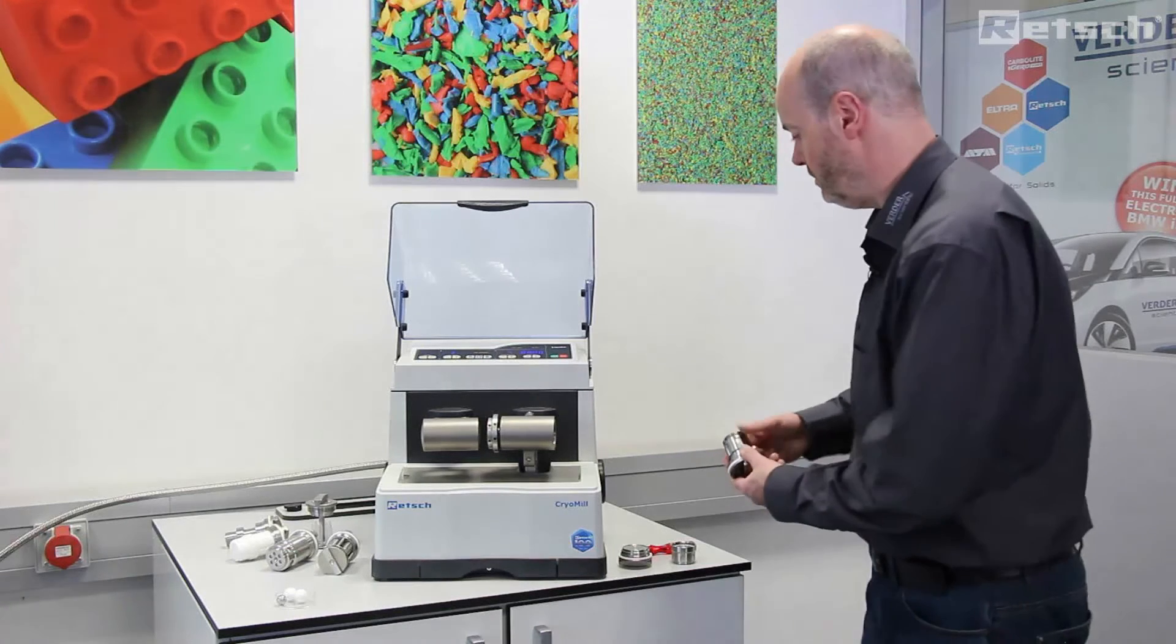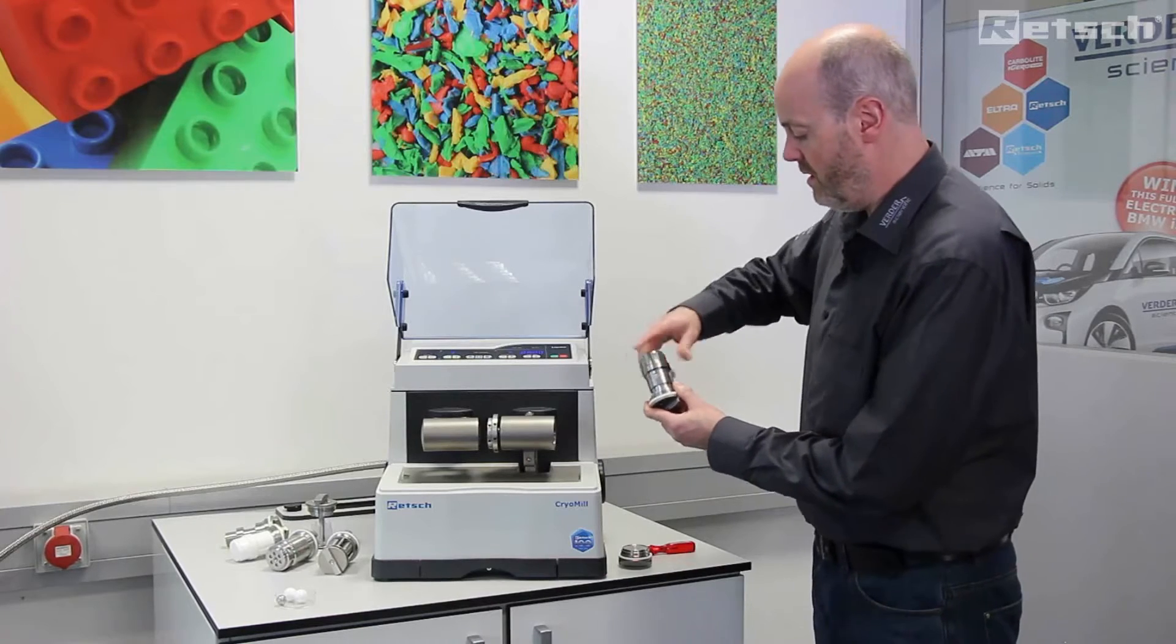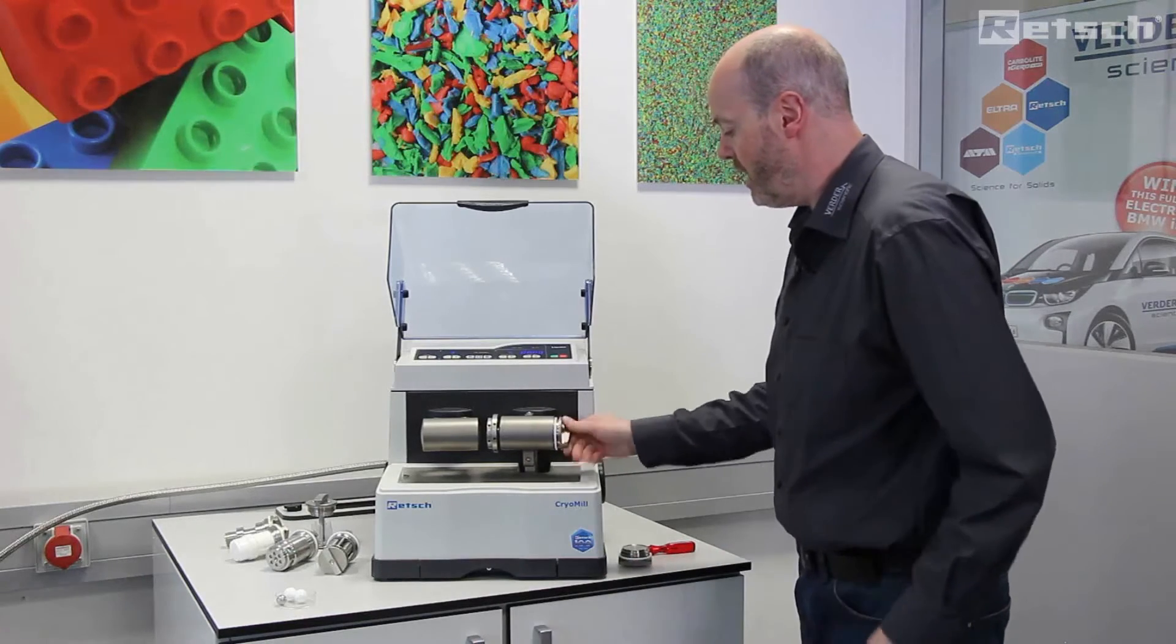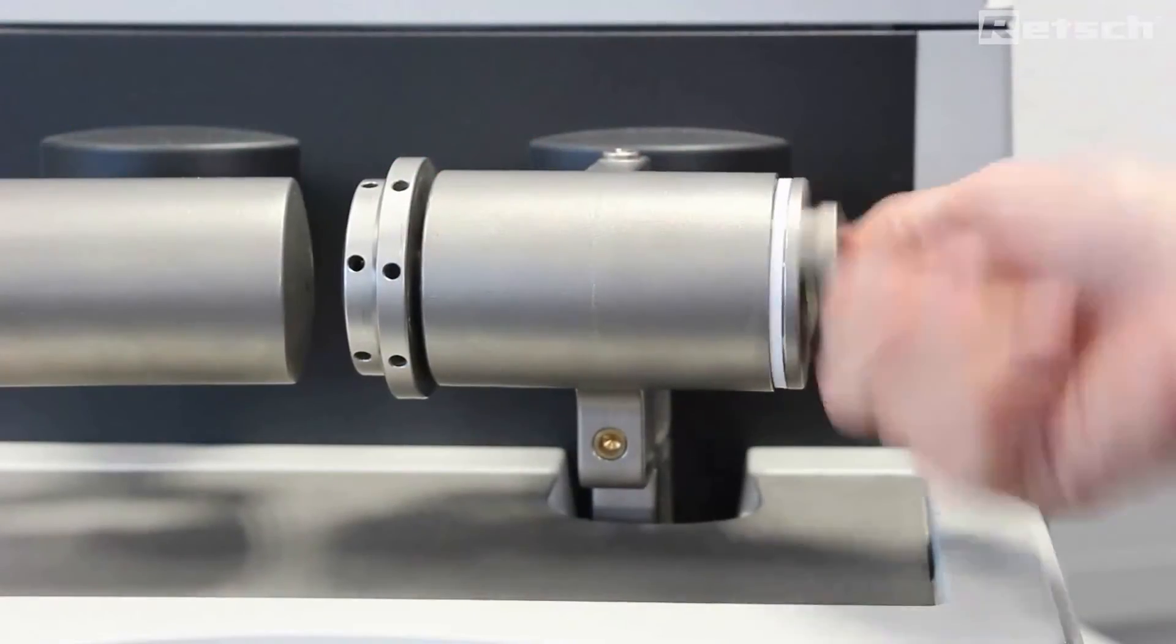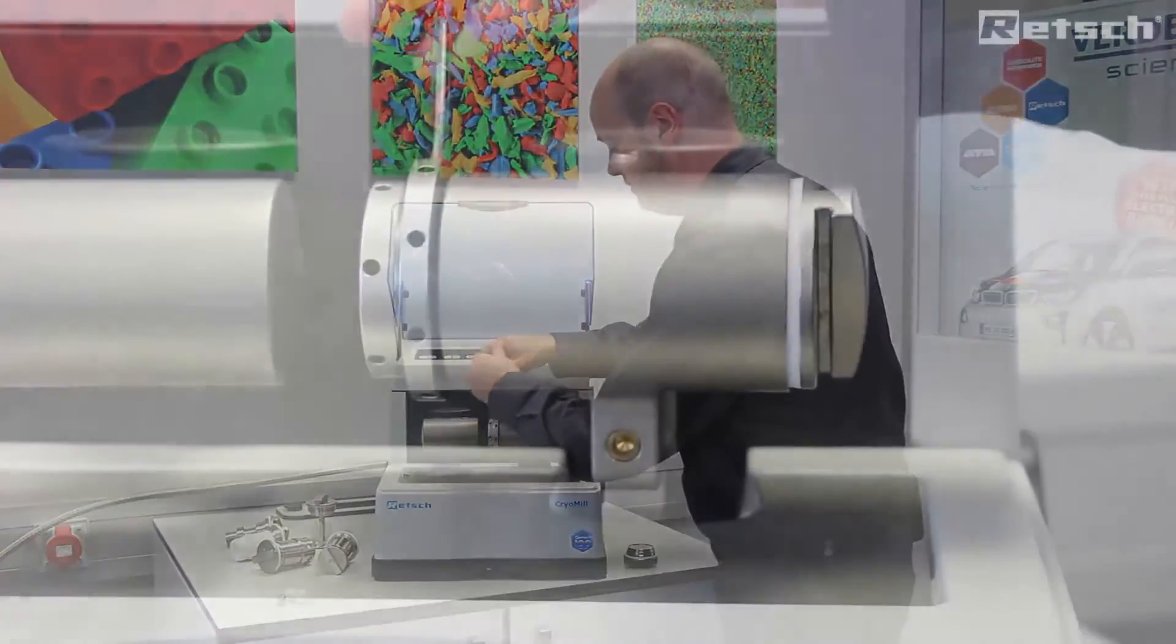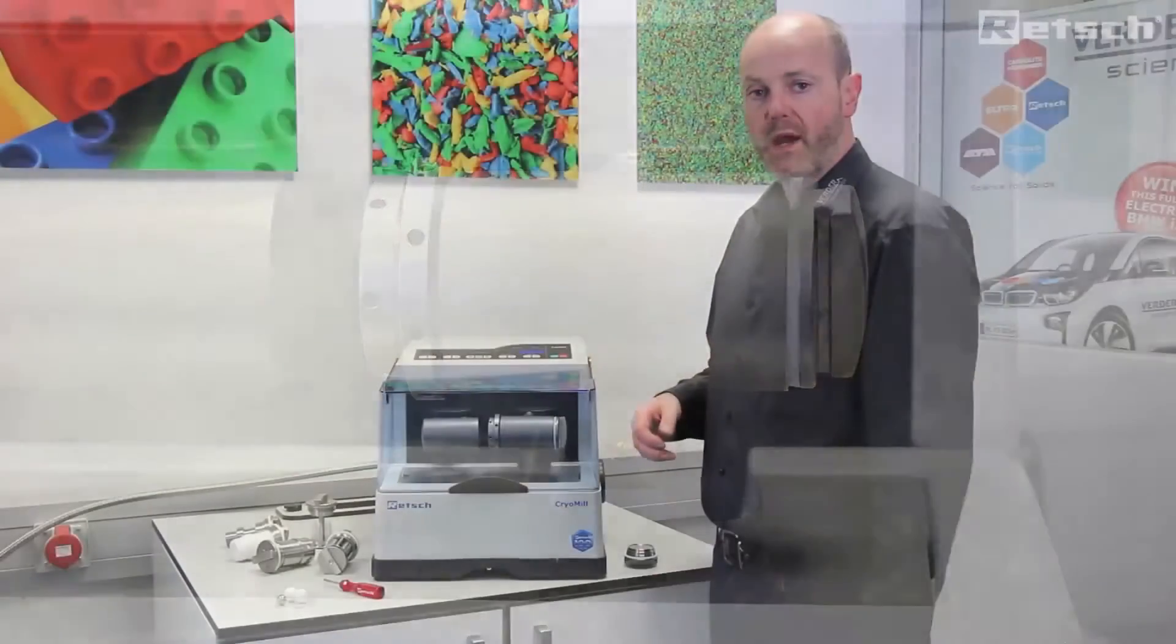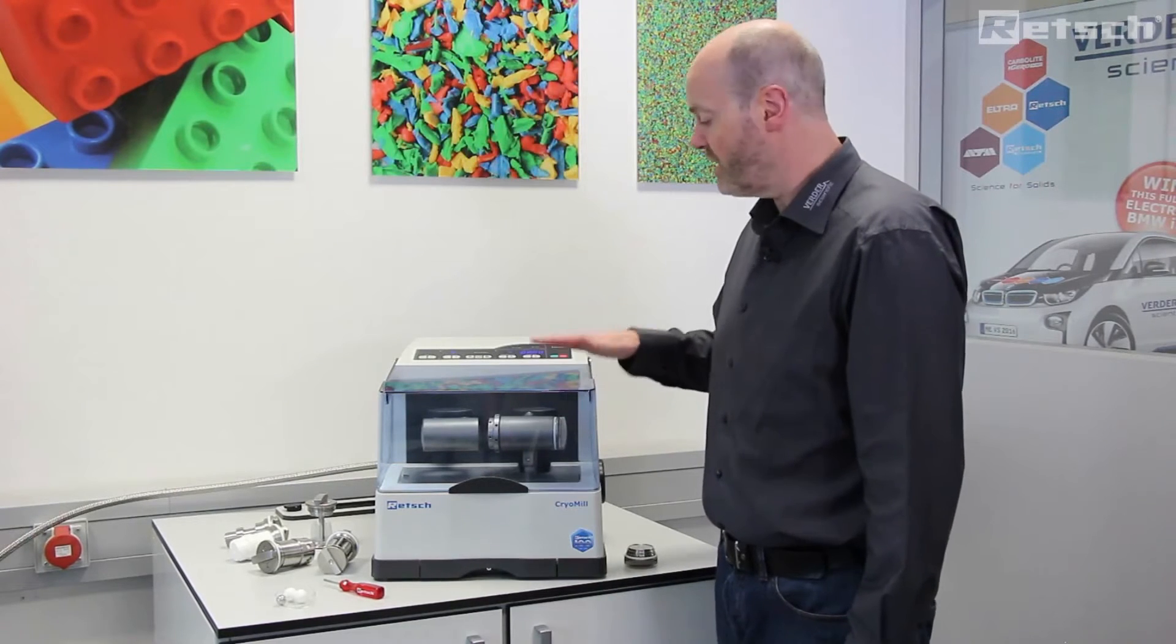The embrittled material is powdered. The jar can simply be inserted, tightened, and with the tool provided, securely locked.